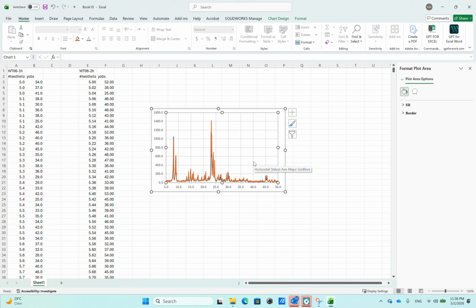So one of the techniques in such kinds of graphs is that we need to draw these samples either in overlapped format or in a stacked format, where you have your samples above each other. The overlapped will be like that, but you cannot see exactly what is happening in the first sample. So I recommend you draw it in stacked format, over each other, by shifting this y-axis. How can you do that?